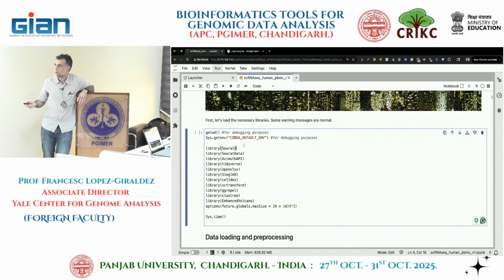These two here are for cell type classification. This is again a library that Seurat makes use of for the transformation, for the normalization. I mentioned the SCT transform during the slides, so we need that. This is for plotting when we create ggplots.